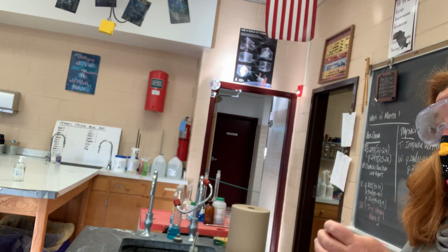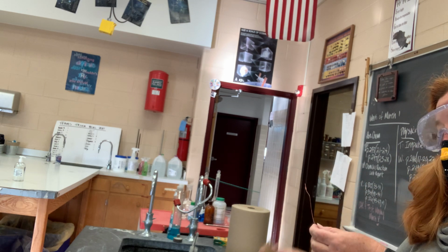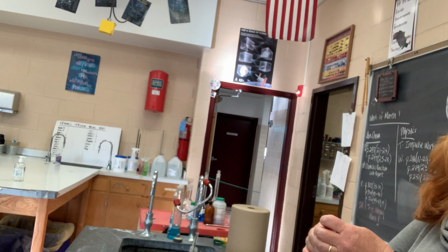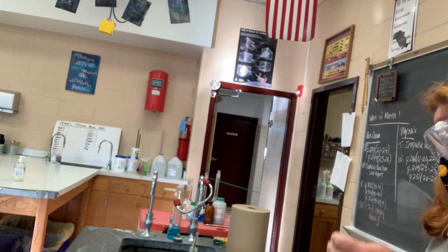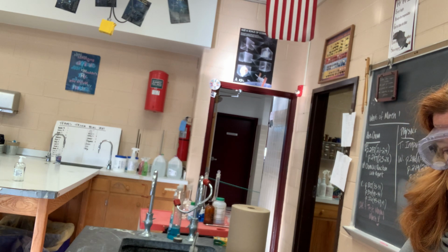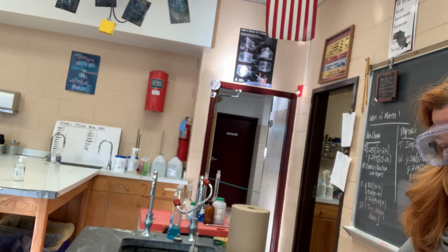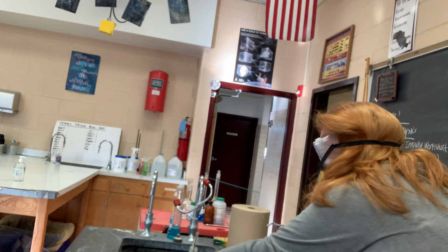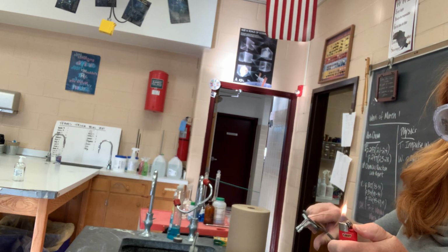So this is part B. It's bendable and shiny, which in science terms means it has luster. That's the scientific word for it. I'm going to do the same thing. I'm going to hold it with the crucible tongs because heat travels in metals pretty quickly. This is not nearly as exciting. I could do this all day long.